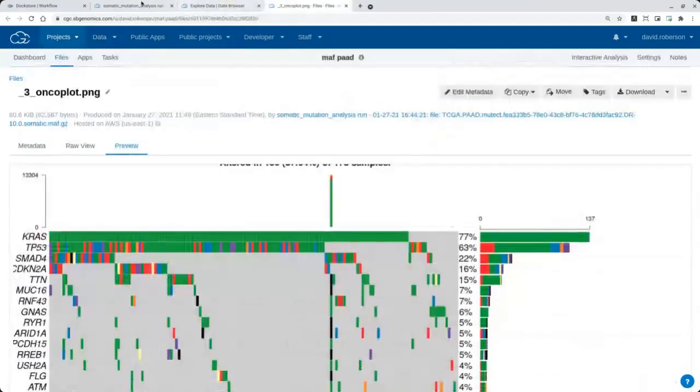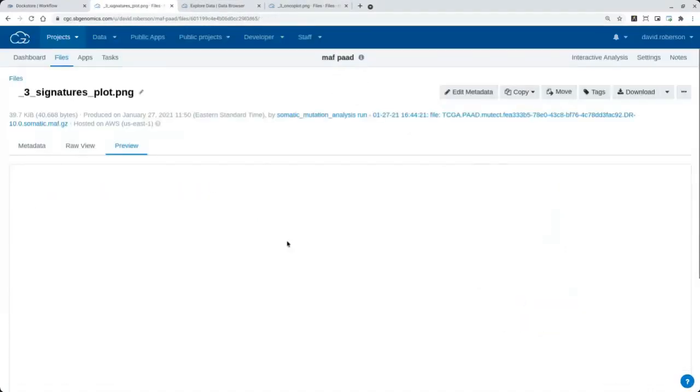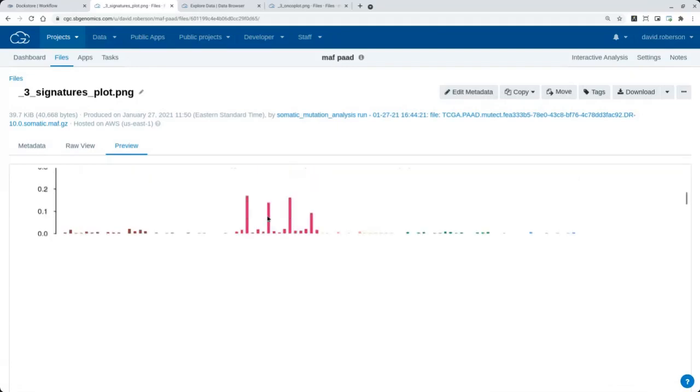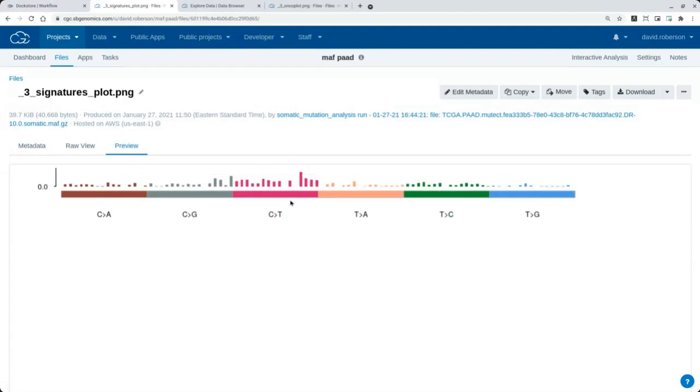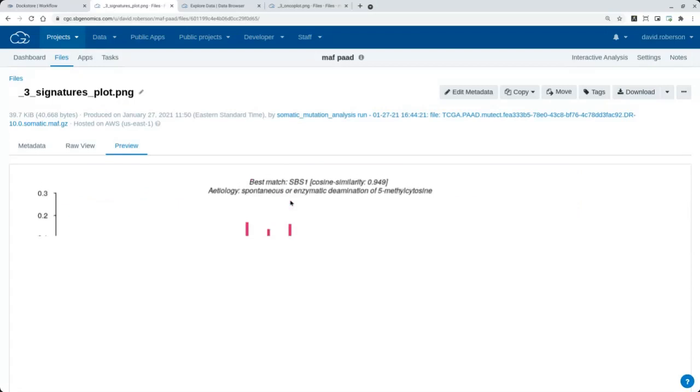And then we could explore the somatic signature using, which one should I pick? This one. So this is a really great, MAFTools is really, really great. Provides a lot of information for you. So this one is showing that we get C to T somatic changes, which is related to enzymatic deamination of 5-methylcytosine, which correlates to usually the age of the subject.